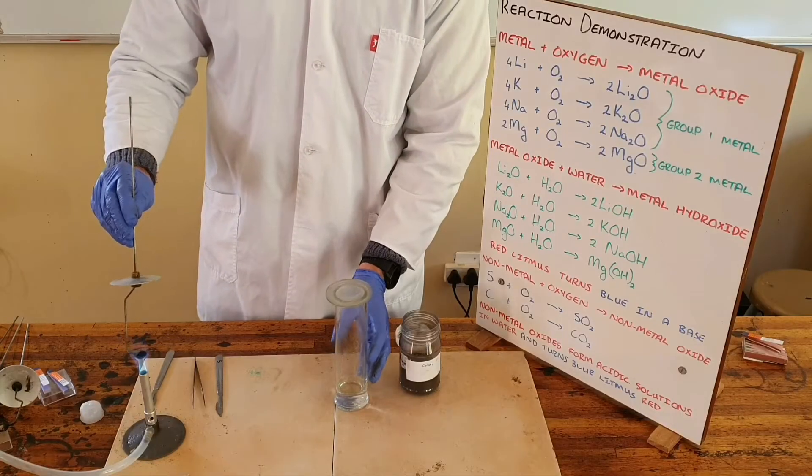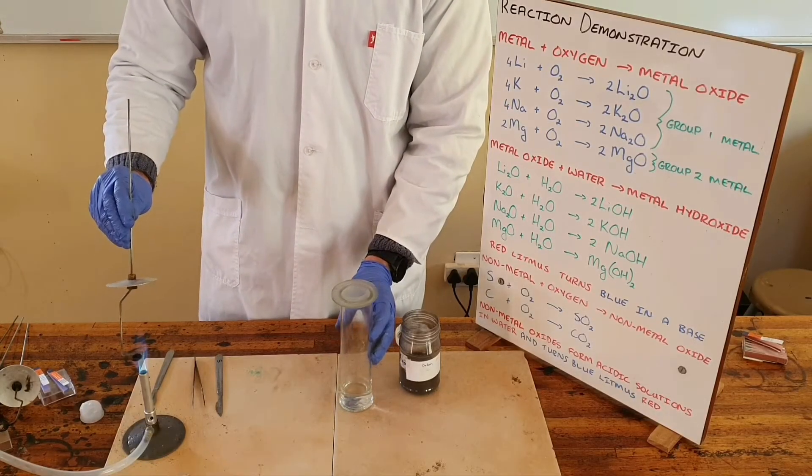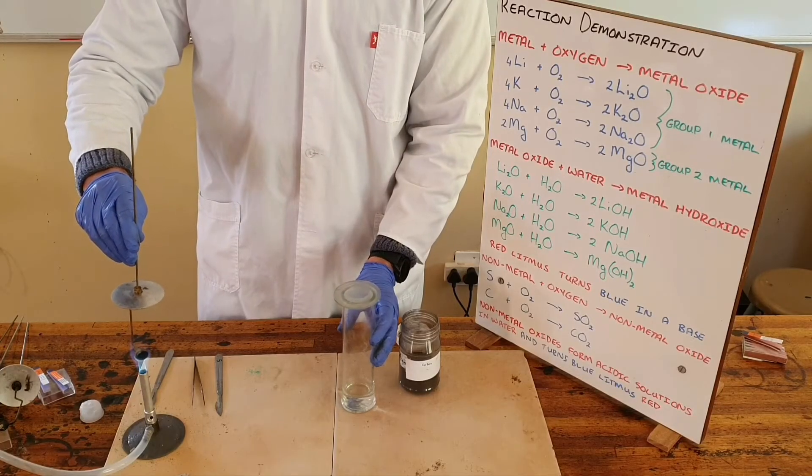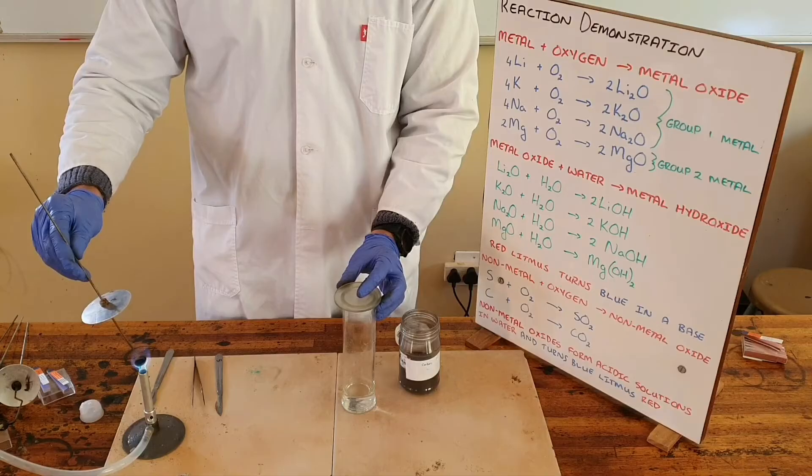Carbon is typically quite unreactive and we can leave it over the Bunsen burner to heat up. Once it ignites we can move it across to the gas jar which contains oxygen.